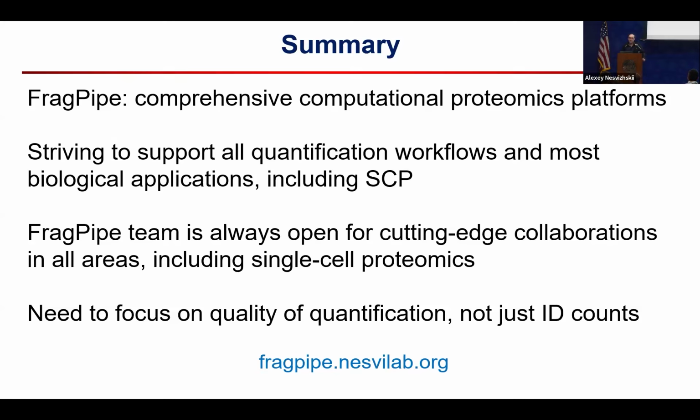So if I understand right, in FragPipe, the default DIA pipeline is to do something like DIA-Umpire, where you create a pseudo MS2 spectrum and then send that through. Did I understand that right? For diaPASEF data, yes. For Orbitraps, it's an option and not the default option.